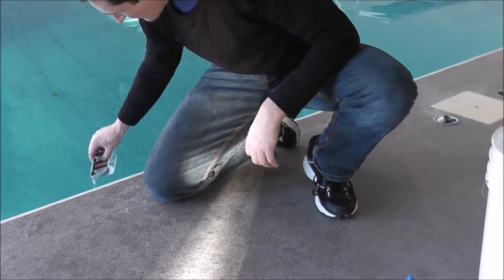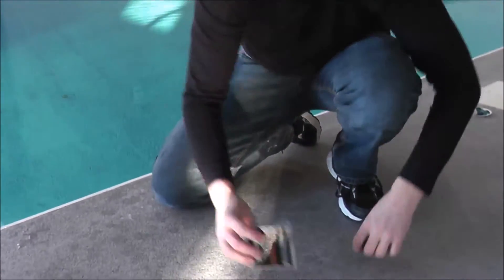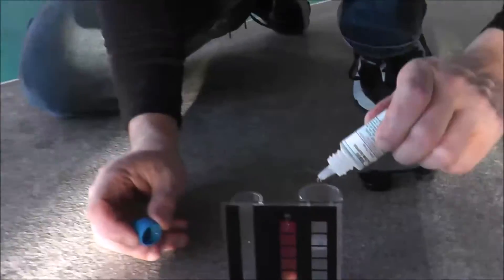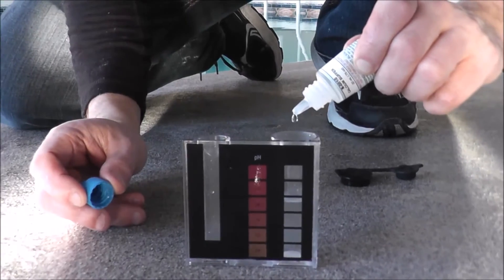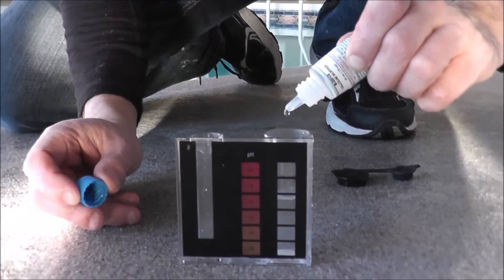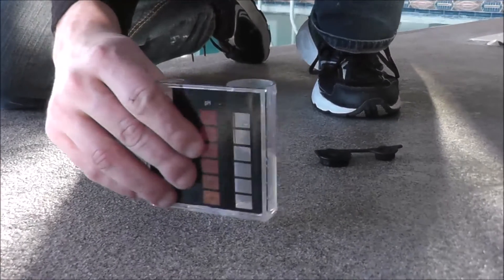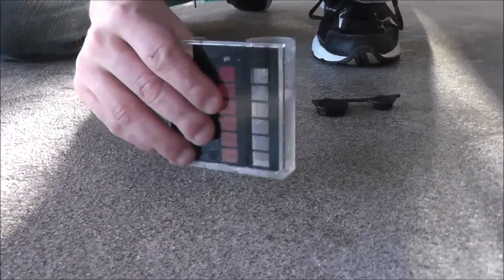The first step of the test is to fill it up to the 25 milliliter mark, and then you add 20 drops of the first reagent. Swirl it around, and then we're going to add the next reagent.